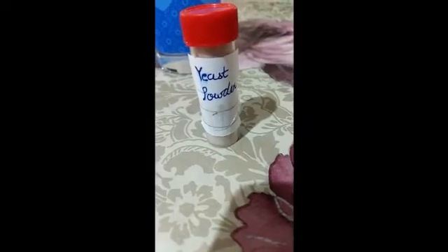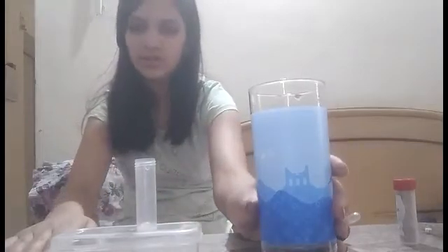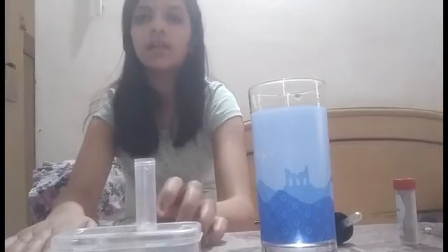For this activity, we need a tube, sugar solution, yeast powder, dropper, spatula and cotton. First we take the tube and fill it with sugar solution with the help of the dropper up to 2/3 of the level of this tube.